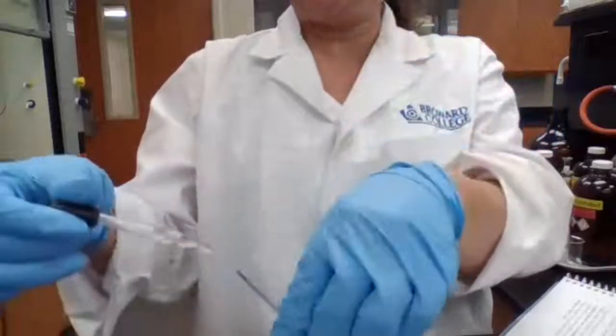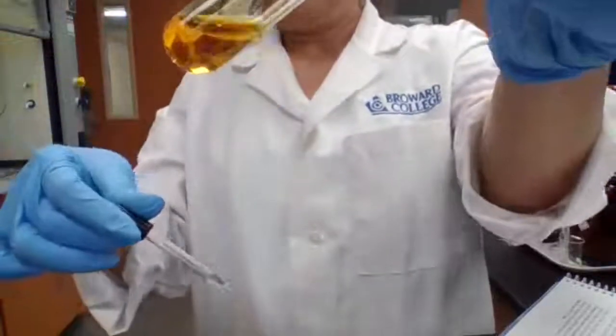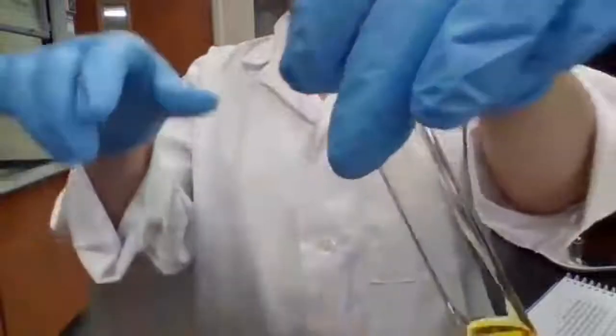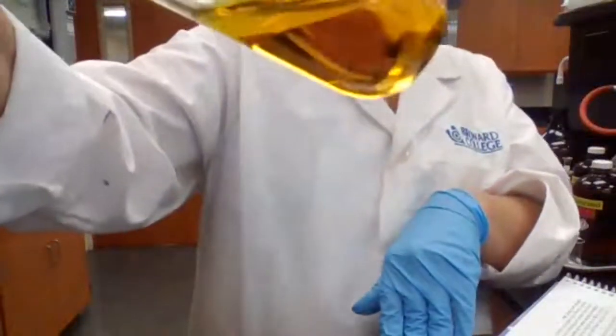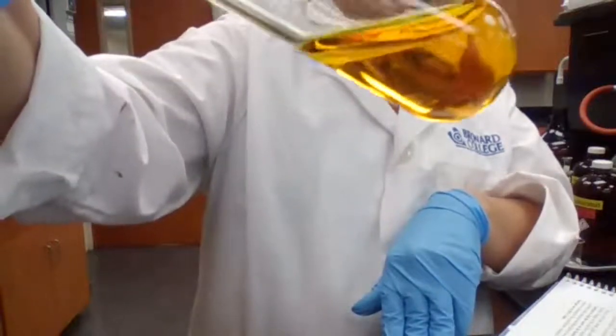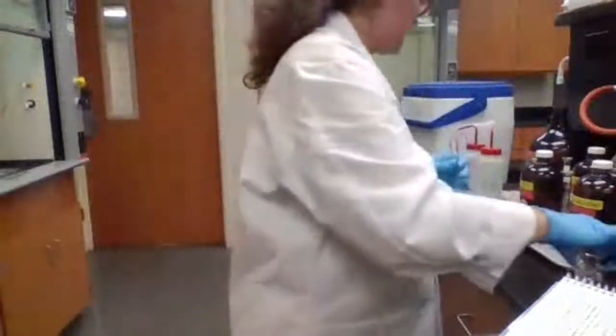So I'm adding H2SO4. See the color change? Okay. Record the new color. This is after adding H2SO4. New color.